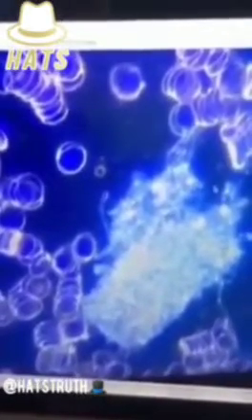This thing here wasn't moving, but this crystallized structure here, they weren't moving like this, but they were kind of growing, sticking out. Wow. This is insane, guys. The doctor found when she was looking at this live under a microscope that this crystallized structure was interacting, was growing, sort of like a network.